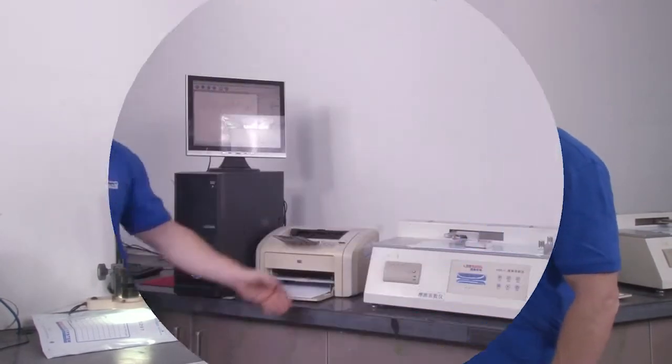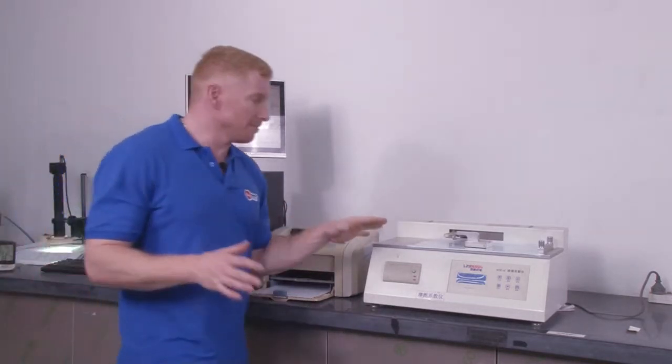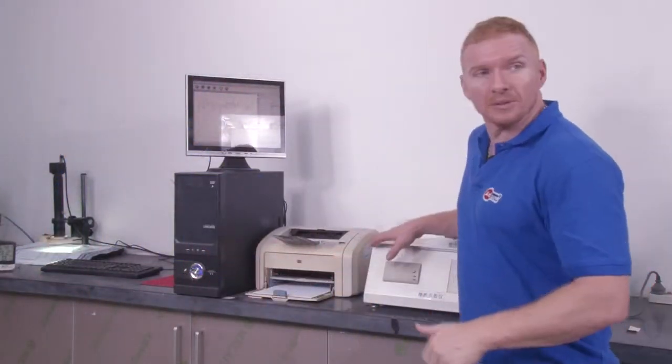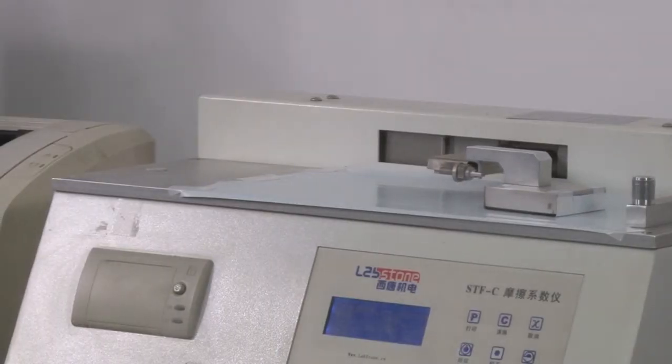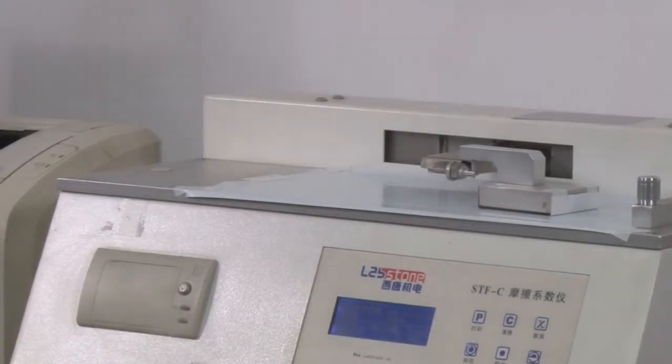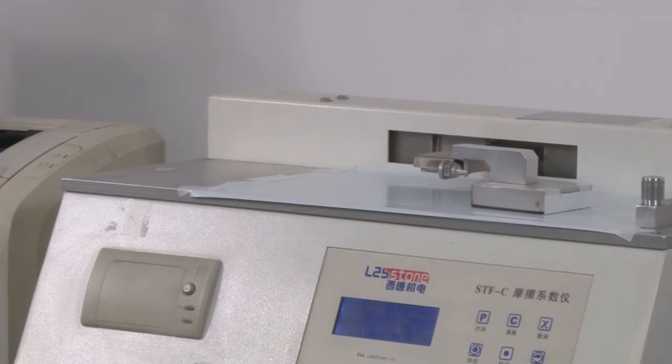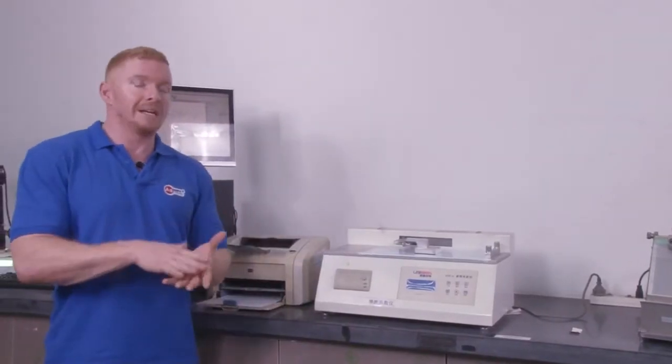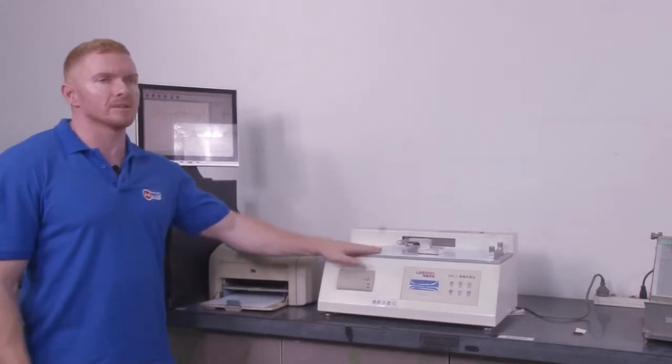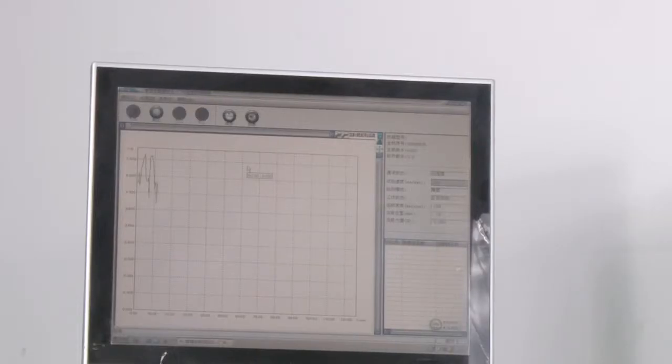This is the machine for testing the surface friction coefficient. This is very important for our film. The inner layer and outer layer are sealed together. We need to make sure it is sufficient coefficient, especially when this is with our glue. It's very important. The glue initially when sticking is not effective, but the surface friction should be enough to make sure the glue is tacky and effective immediately.